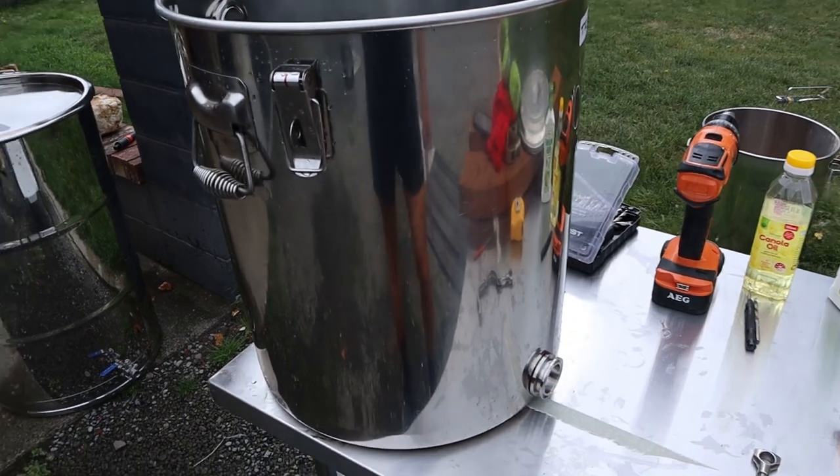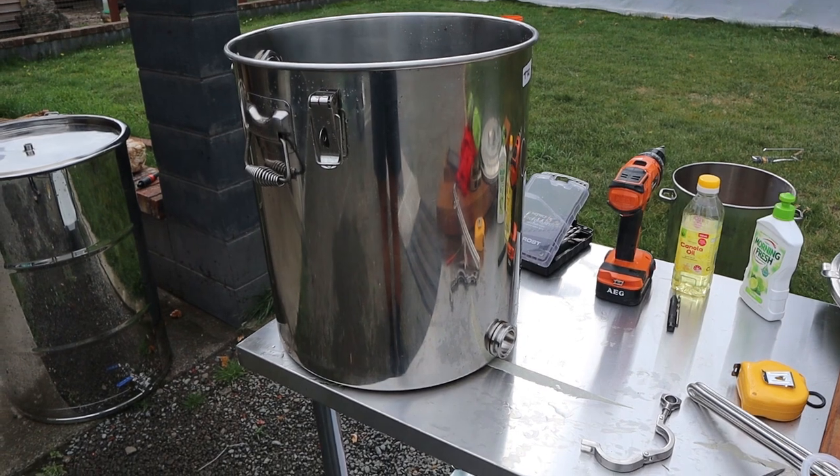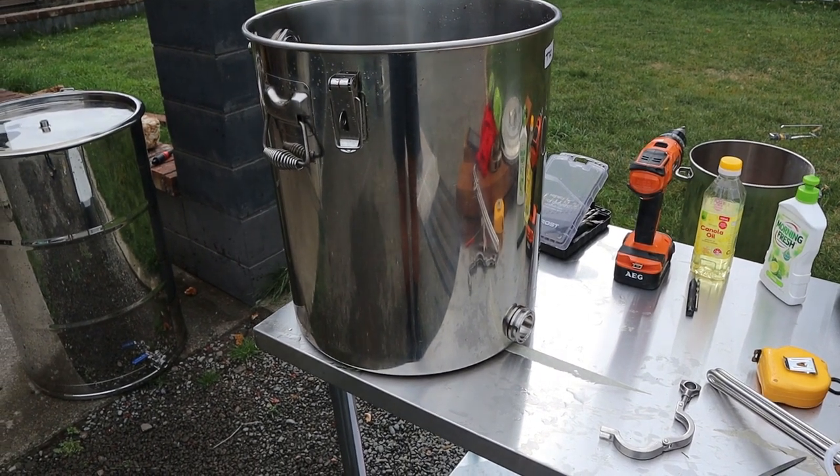That can happen if you have a failure of the float valve or the water supply. So I decided to reduce that risk of fire and build a separate boiler. Here's the boiler — it's actually a honey jar or vat, designed for collecting honey.